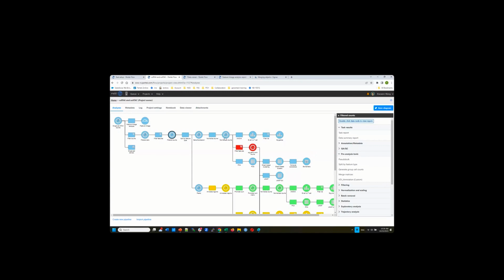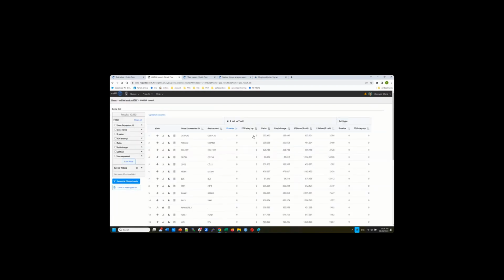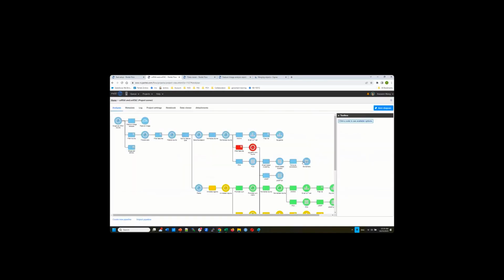But I just want to mention that when I perform all that, I generate a UMAP. I use the UMAP based on the graph-based cluster information from gene expression to identify the cell type. And once the cell type is identified, I can perform differential analysis and generate genes for the differences between cell types or between phenotypes, all the different comparisons. If you have multiple samples, you can do so. Okay, so this part I think we're familiar with.